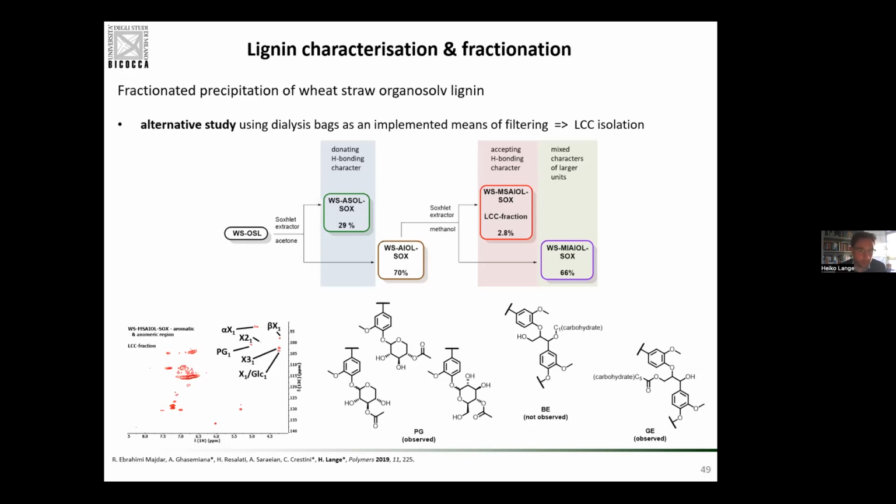So if we do not like the LCCs to be in the wheat straw, or even better, if we want to use the LCC fraction for a valorization, maybe in the biomedical field, because we like the fact that we have sugars attached to the phenol, so we have, you know, the best of both worlds practically in one molecule attached to each other, we can isolate it.